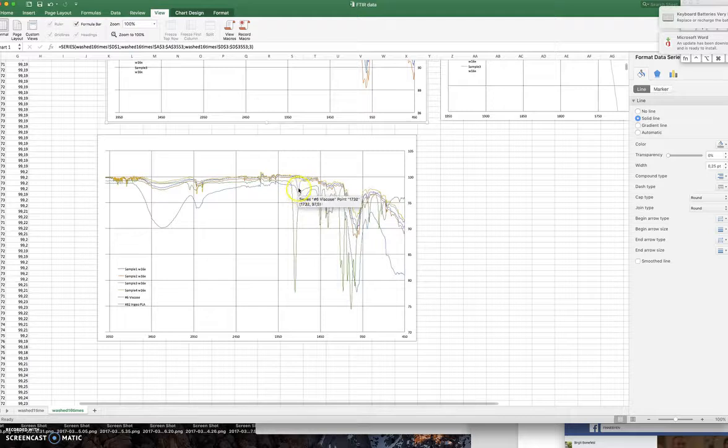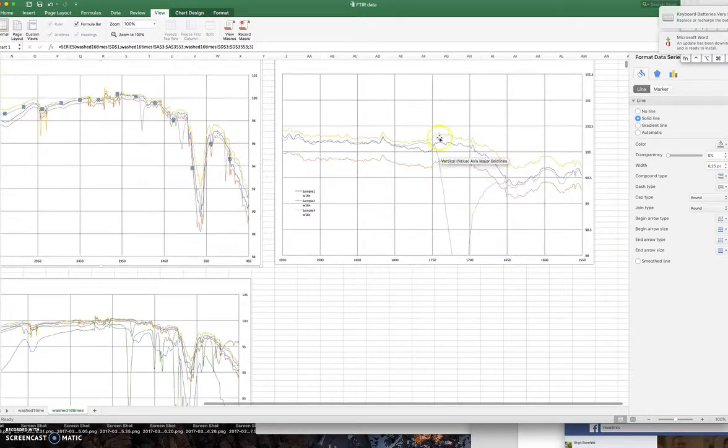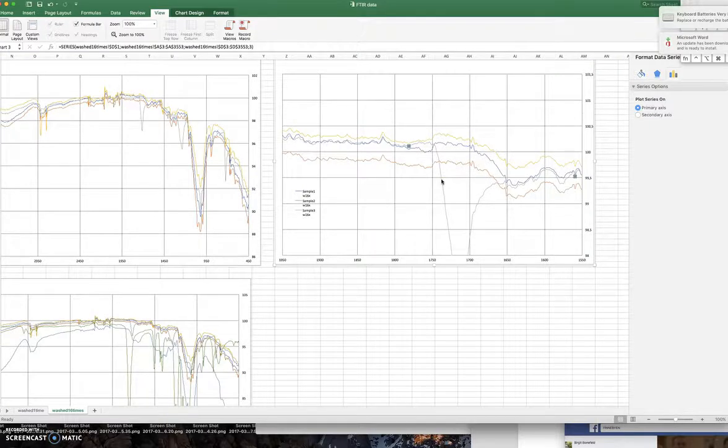And that is also visible here, maybe a little bit shifted, but it still looks as if this is the one. And actually, I didn't change this one. I'll do it before I send it to you, so that the axis here has been modified. But according to this close-up, the gray one here is the only one with PLA in it. The 3 other ones only have viscose. Yeah, those were the words for now.